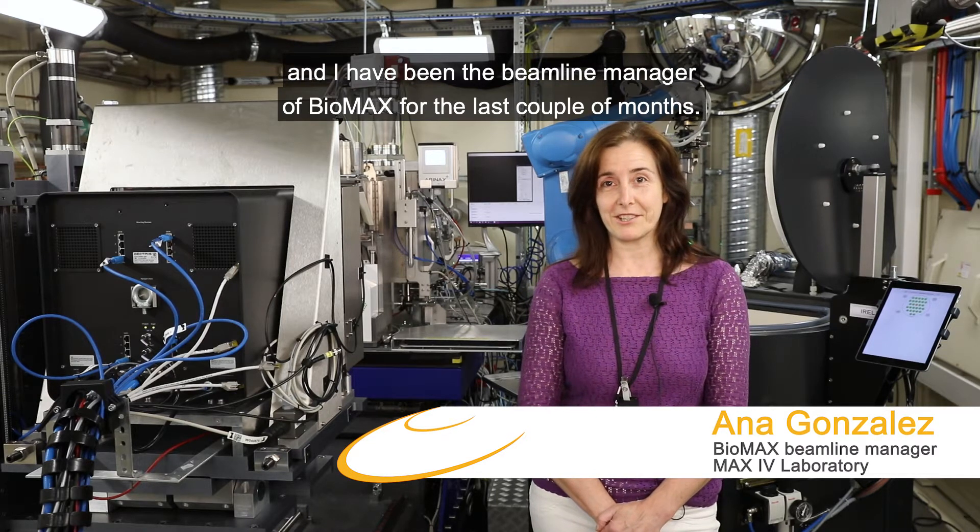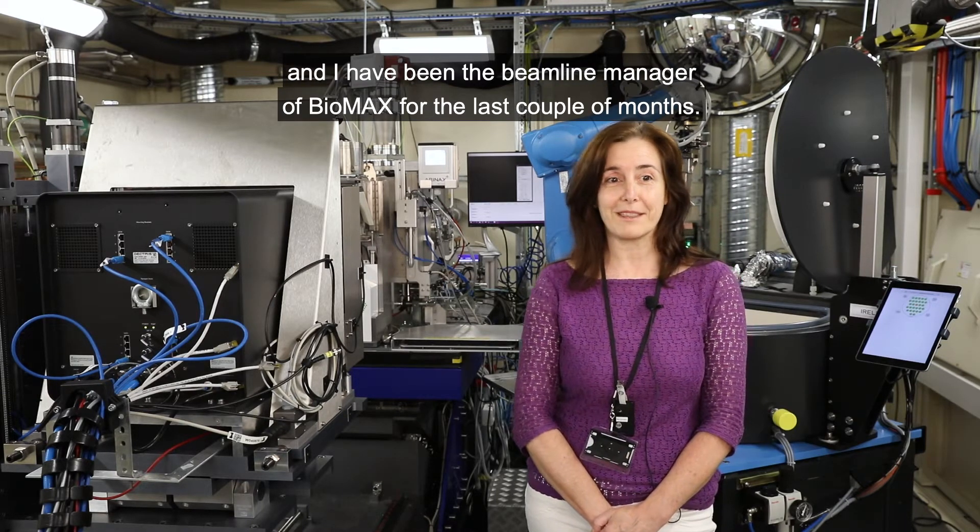Hi, welcome to Biomax. My name is Ana González. I have worked at MAX IV for two years and I have been the beamline manager at Biomax for the last couple of months.